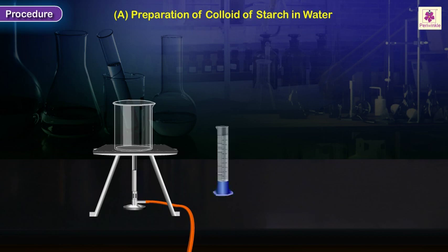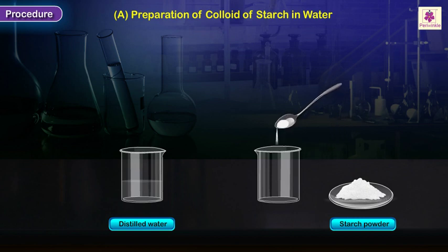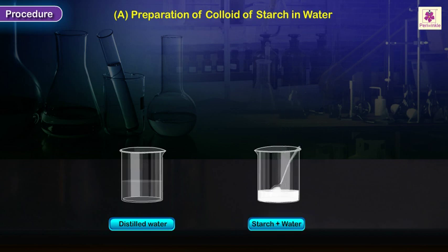Take about 50 milliliters of distilled water in a clean beaker and heat it to a temperature of about 50 to 60 degrees centigrade. Take some starch powder in a beaker, add some water to it, and stir the contents using a clean glass rod to obtain a paste. Transfer a spoonful of the paste to the warm water in another beaker.